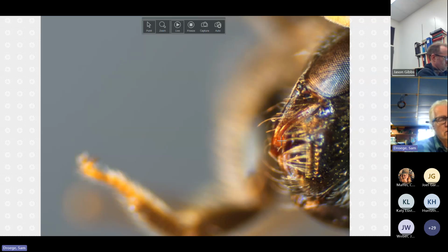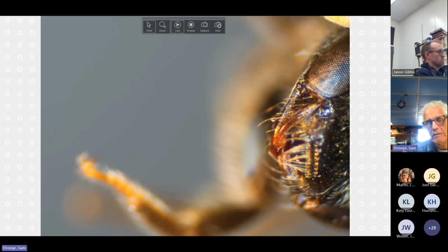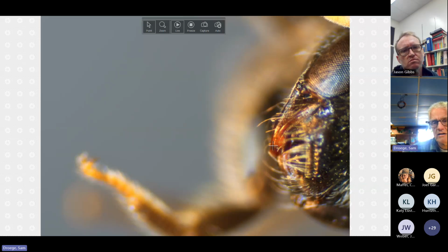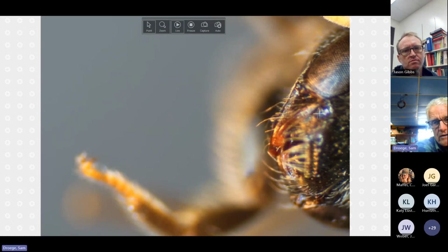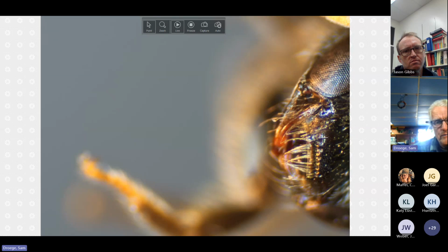This is a little bit difficult to show a good shot of without it being obscured by other things, but the mandible itself is as if it were bent, as if you pushed that tip in towards the head and instead of breaking it, it bends in like that. It's a little bit hard. So here you go. And when you're looking at this raised carina on the edge, when the thing is closed, it's hard to see, but it would be up here somewhere.